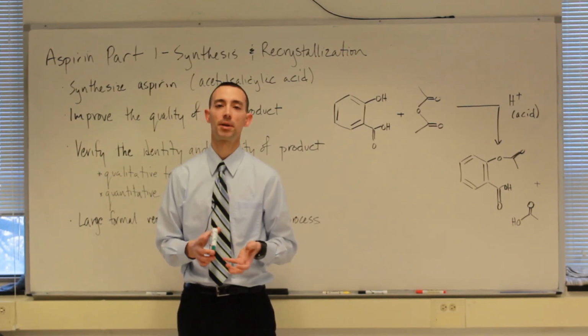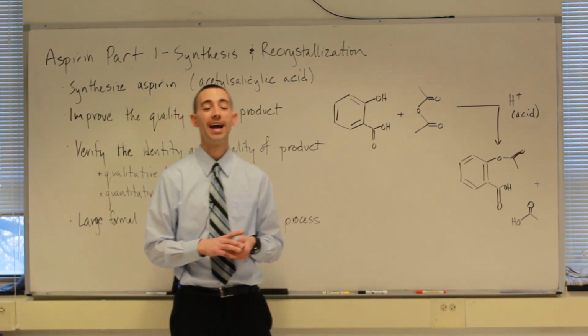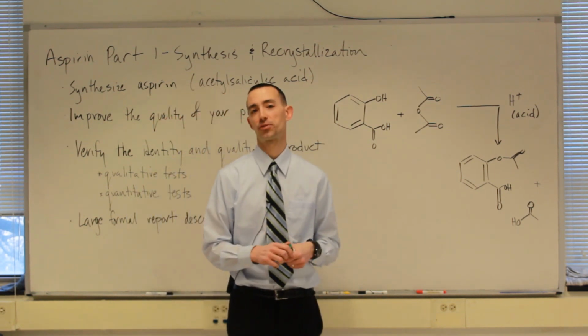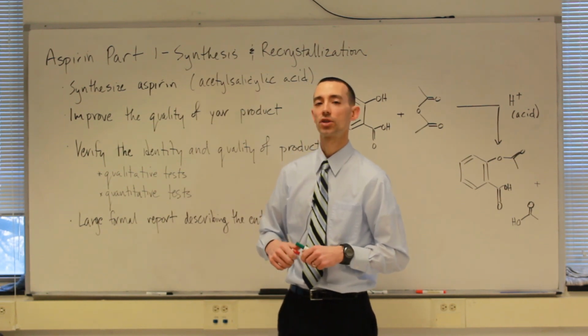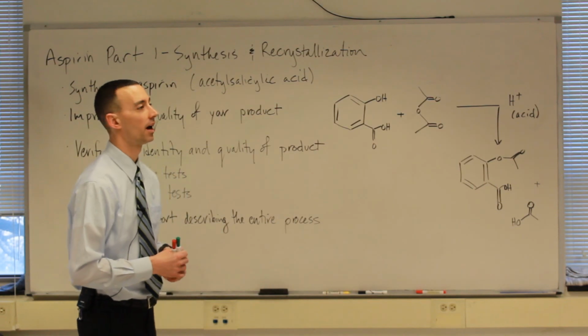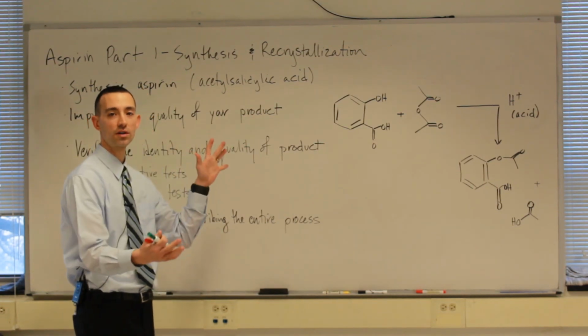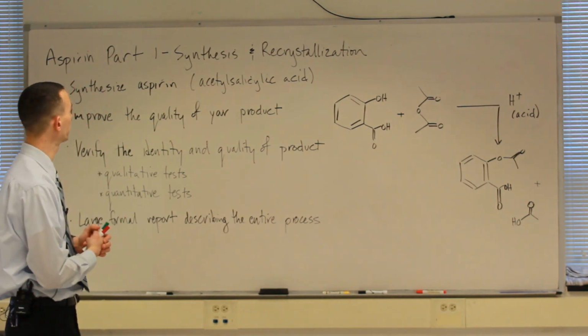So we're going to learn a little bit about this synthesis and then some of the techniques that we use to analyze not just aspirin but other chemical compounds. So let's dig into what's going to happen this week and get you ready for an exciting, I think, long-term project. 3 consecutive weeks devoted to the same topic, really.